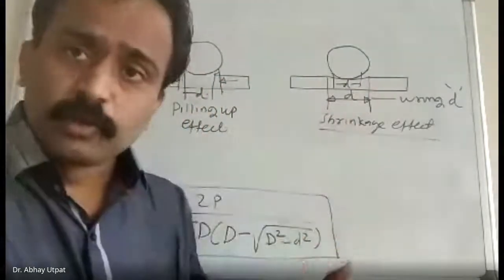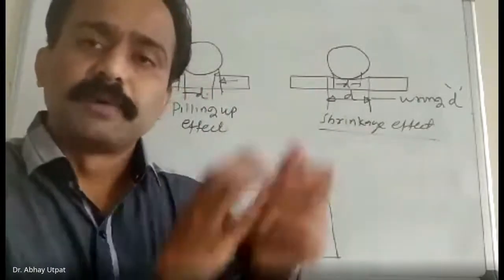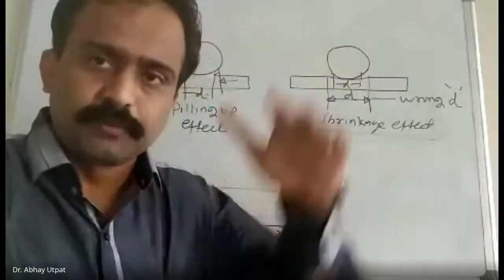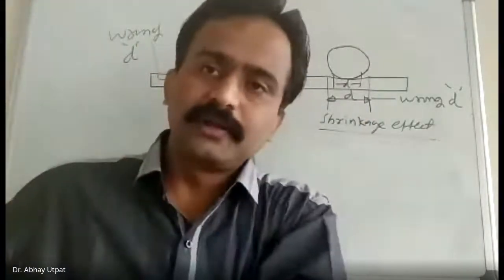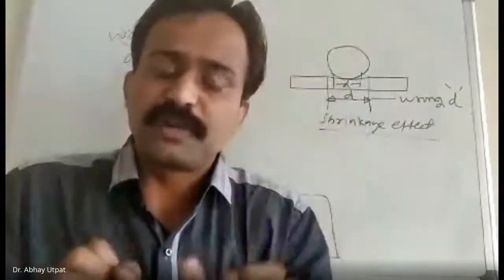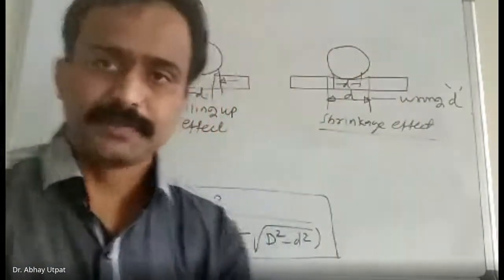Because of this heavy load, 3000 kg load, 10 mm ball, the machine is synchronized to the shorter values proportionally. The machine in our laboratory does not have a 3000 kg load. So the machine is proportionally reduced in all dimensions.